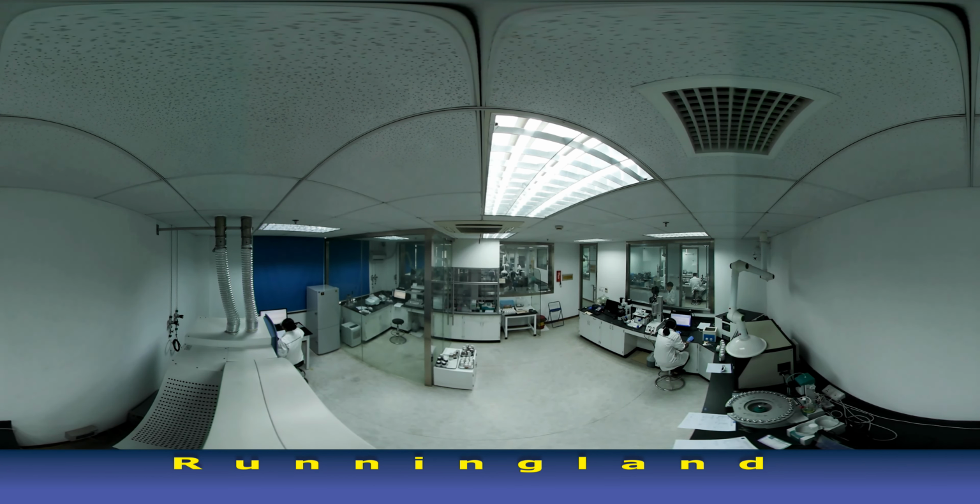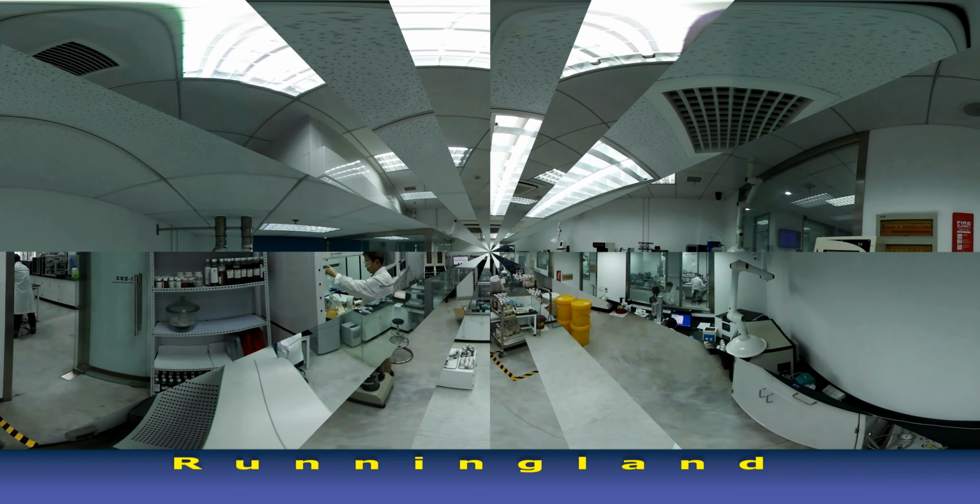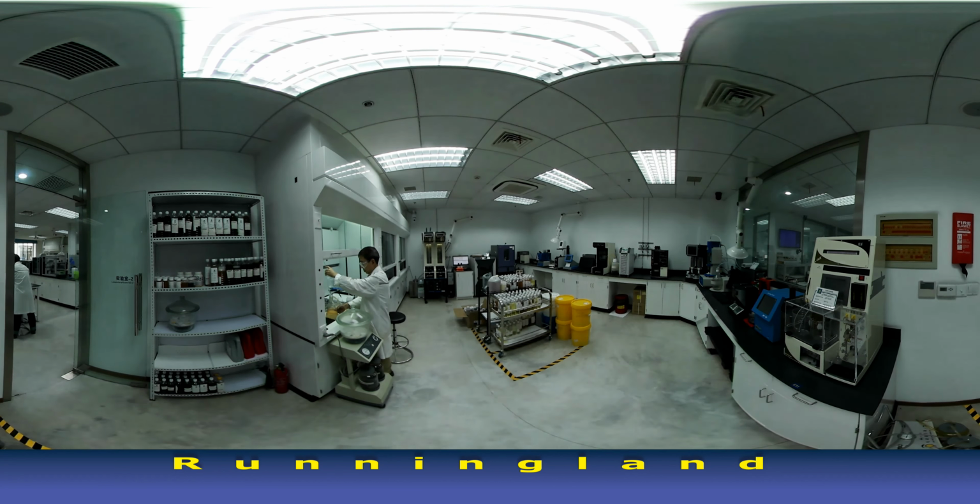and so on. Now, if you noticed in the enclosed glass room, the temperature in that room is properly adjusted for infrared spectroscopy. Runningland's FTIR is supplied by Perkin-Elmer, which is a highly flexible and configurable system used to identify contaminants and fuels. Our next segment is laboratory number 3, where we test for viscosity in different liquid bath temperatures.